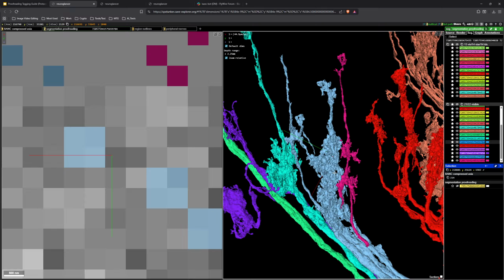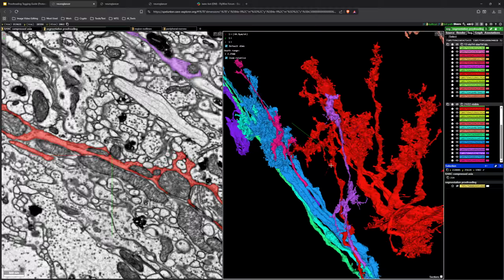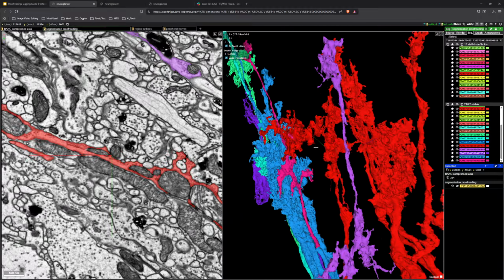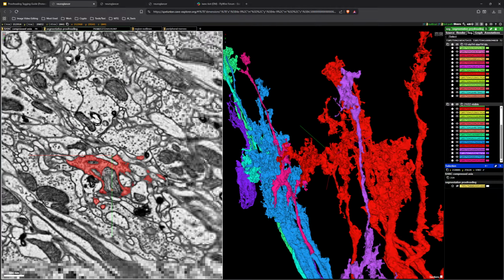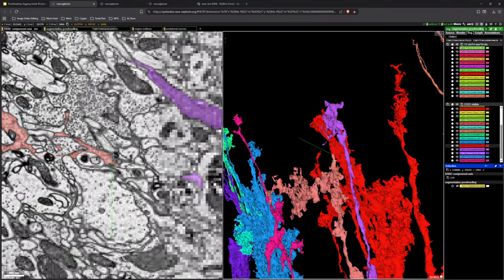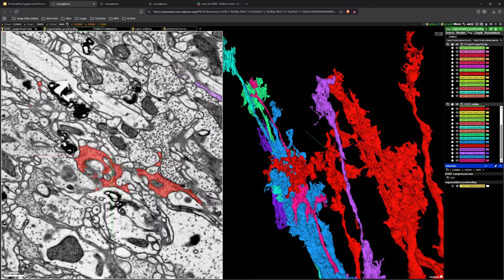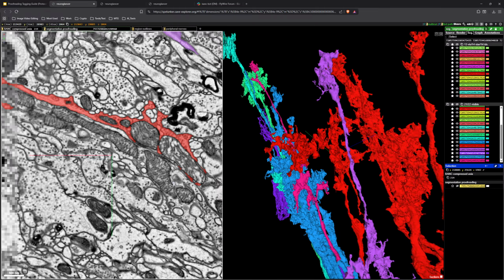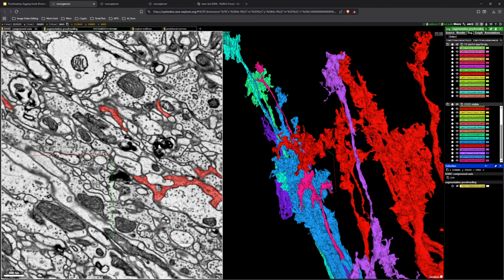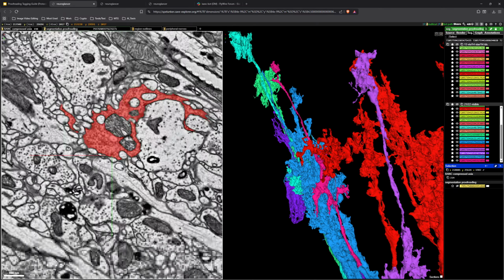It's probably this, but considering we don't know, we can't rule out that it could be any of these, right? So we can see some stuff has been traced here. This tip we check seems good. And we can just keep doing this until we are sure that it is proofread to the standard of the assignment.